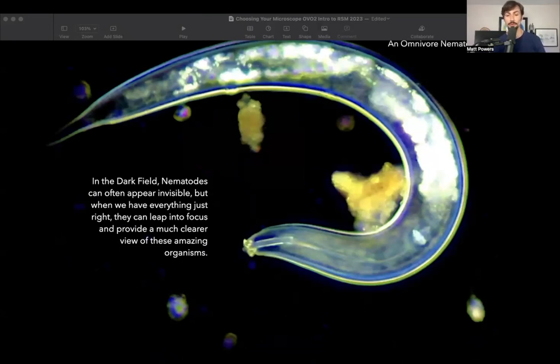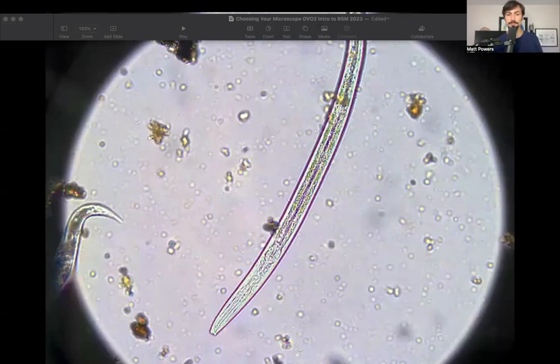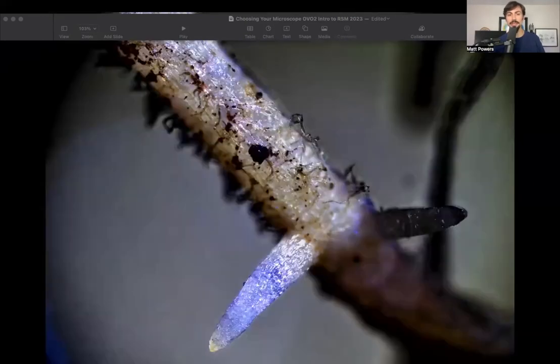It's a bacterial omnivore. A lot of nematodes are switchers. A lot of nematodes, if they can fit their mouth around it, they'll eat it. This is a bacterial feeder, and you can see there's a type of clarity that you don't get otherwise. This is the lighting technique that I was really surprised that no one else had figured it out before me. I'm still kind of in shock that no one had figured this out.